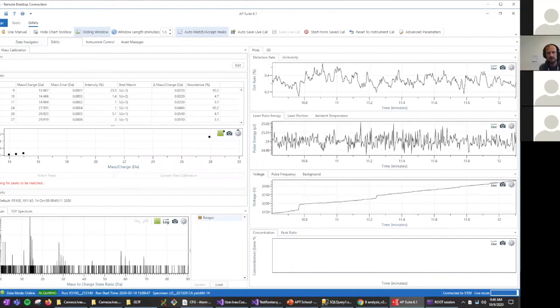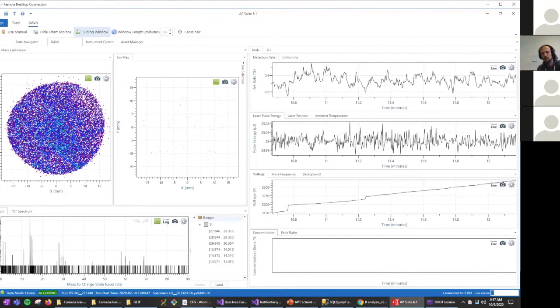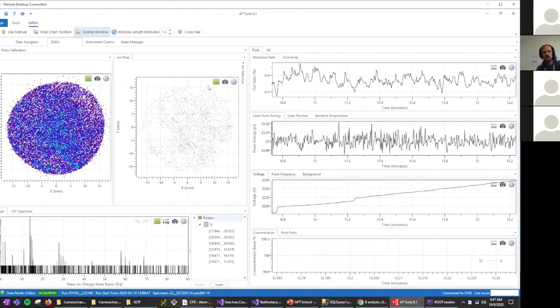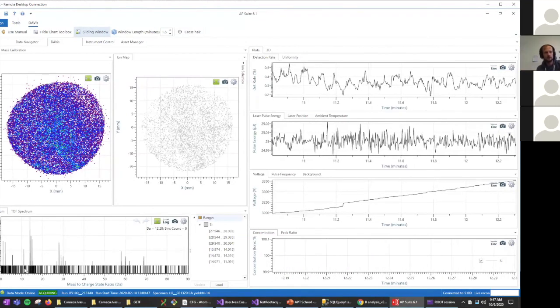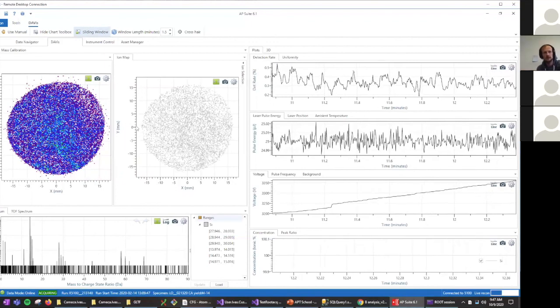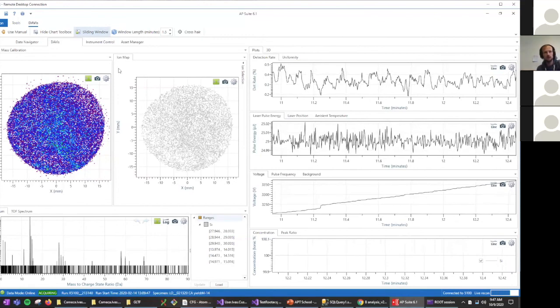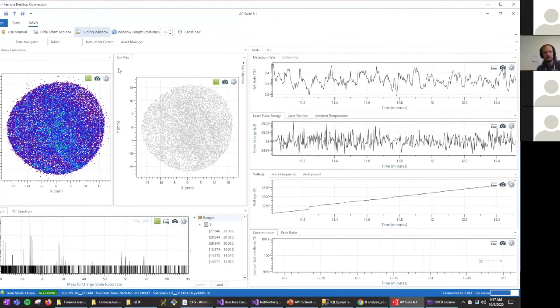For instance, even if this workflow that is within APSuite 6 would just be annotated with the metadata, and if there would just be a convenience function or convenience button in the menu of APSuite where you can say, tag my analysis and workflow ready for publication as a supplementary piece of information.